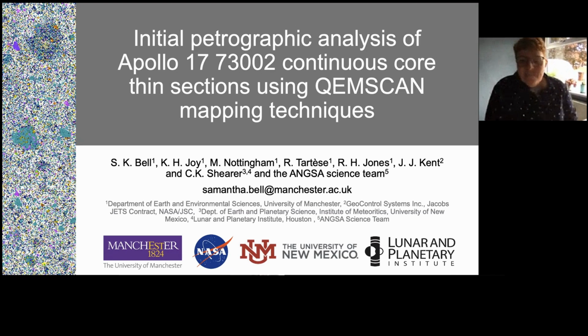Thank you. So yeah, I'm Sam, a postdoc at the University of Manchester, and we're presenting some work that we've done as part of the ANGSA programme. We're one of 3 institutions in the UK, along with colleagues at the OU and the NHM, that are fortunate enough to be included in some of the sample analysis that's been headed up by Chip Shearer. So today we're showing some work looking at the petrology of these Apollo 17 73002 continuous core sections using the QEMSCAN techniques.